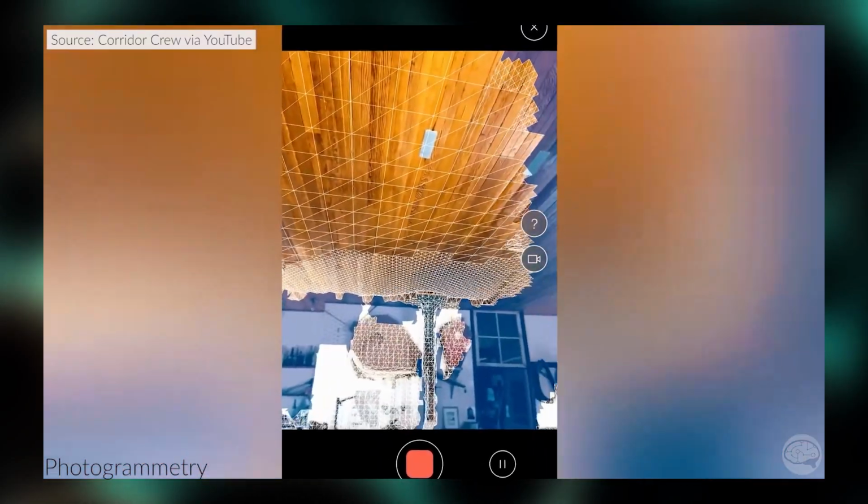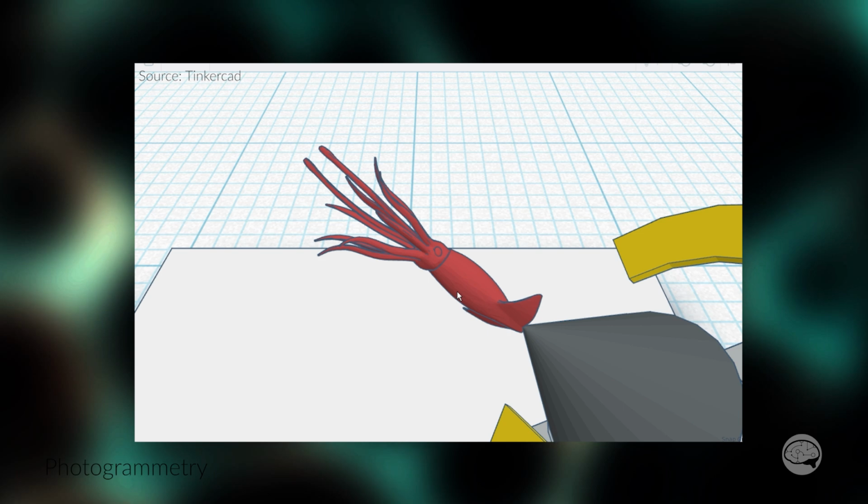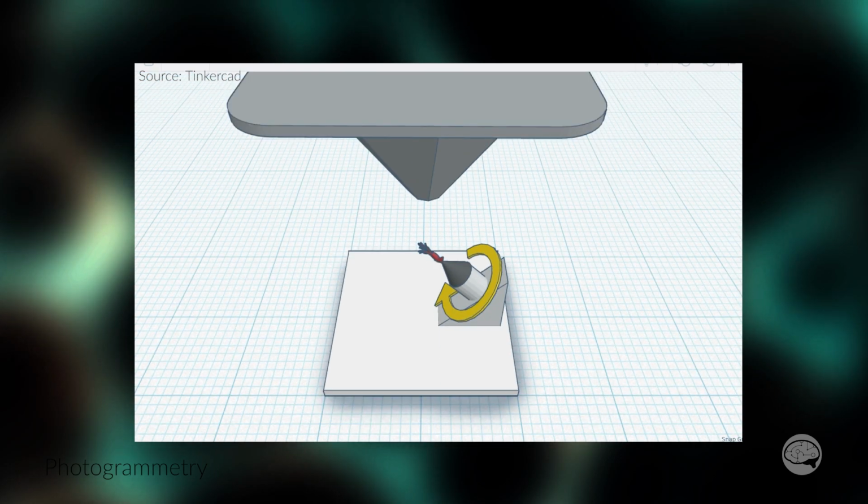Not that there isn't software that could handle this, the problem is the image acquisition. You would likely need a specialized substage to go into the SEM and rotate the sample around as images were being collected. You could do this manually, but it would take forever. Now, I might be wrong about all of this, but as far as I know, this is still something that's in the future as of 2025.